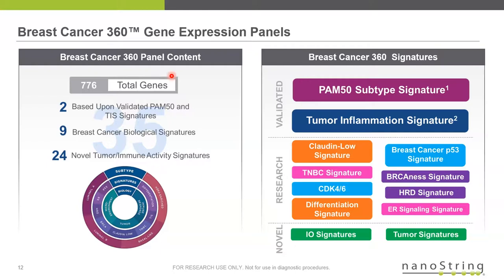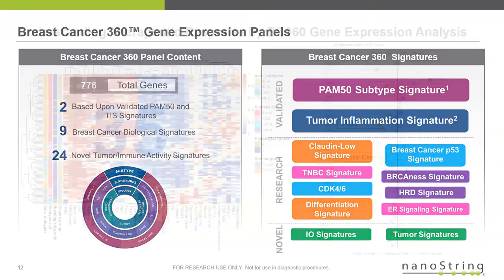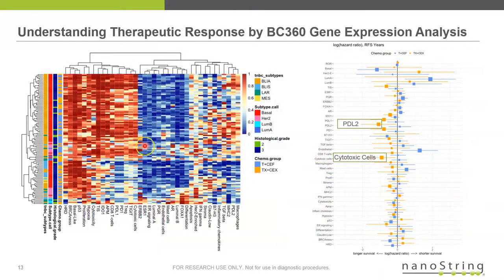So we're not looking necessarily at just the gene-by-gene level, but at different signatures, as you see called out on the right. If you look at all the samples that were run in this subset of the FinXX trial on the y-axis, and on the x-axis, the strength of these different signatures, first off, you see a great amount of heterogeneity across the samples and across the study groups.